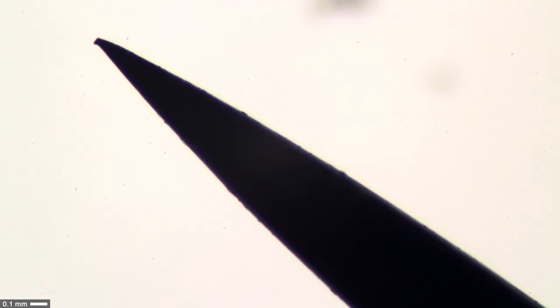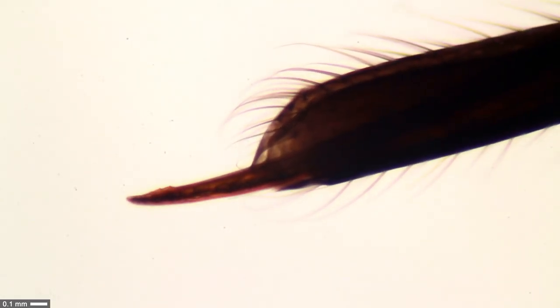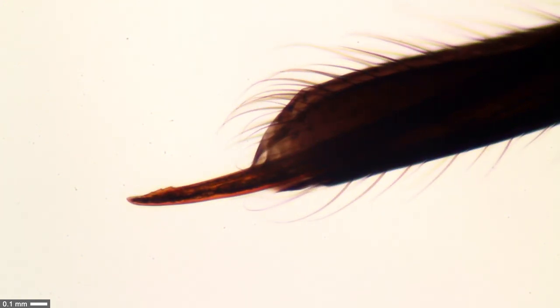And here this again at the same magnification - the stinger itself that we just looked at before for comparison.